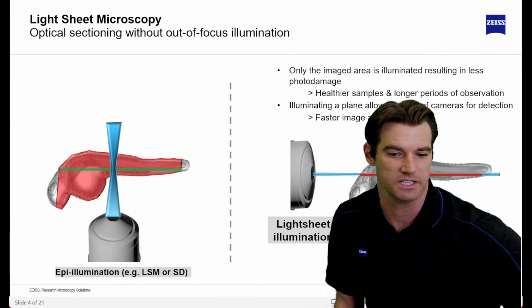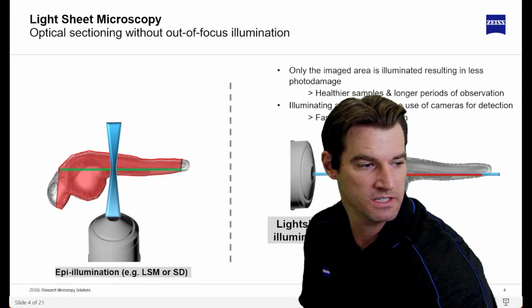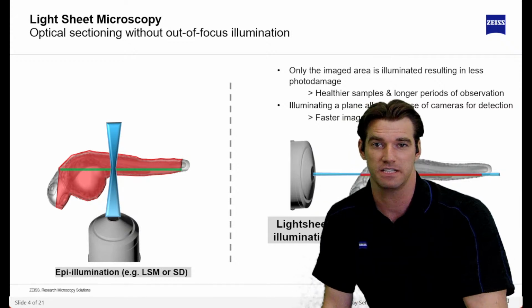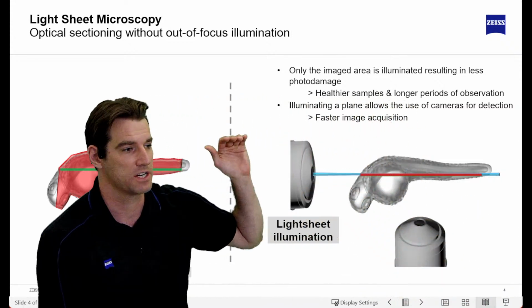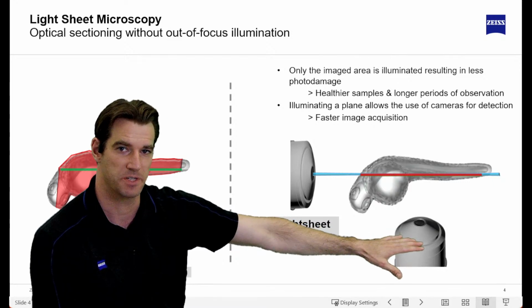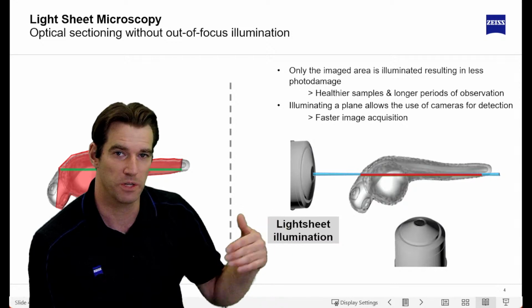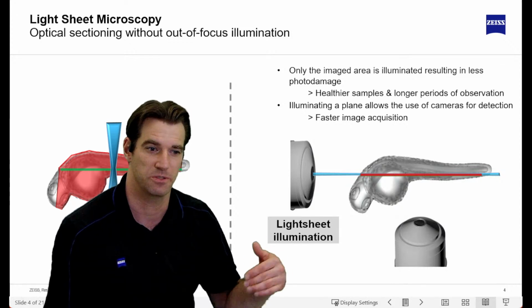So even though you're focusing on a smaller portion or a single plane of the sample, you're still sending the light all the way through. And so if you have a Z-stack that is going to be 50 sections, then you're illuminating it 50 times every time you take a Z-stack. Right? Light sheet microscopy is a solution to this, because you have an objective that is sending your light sheet through the sample, and then you're collecting it with your collection objective here. And so now you are only illuminating the exact plane that you're imaging every single time. And you can go through the entire sample, and you only illuminate the volume a single time. So we've gone from maybe 2 orders of magnitude for cell culture to 1.